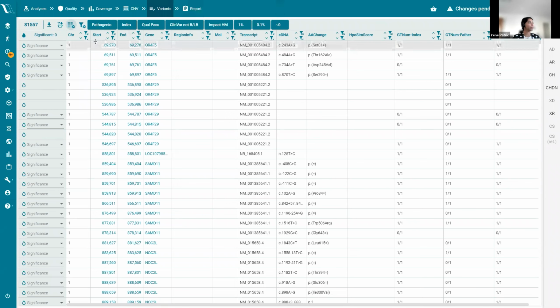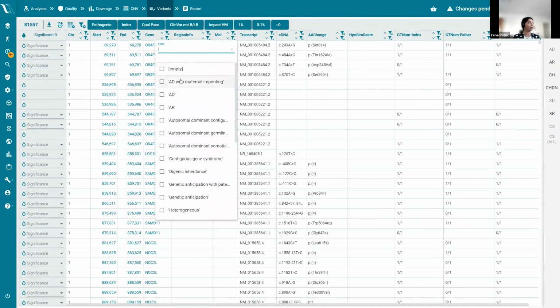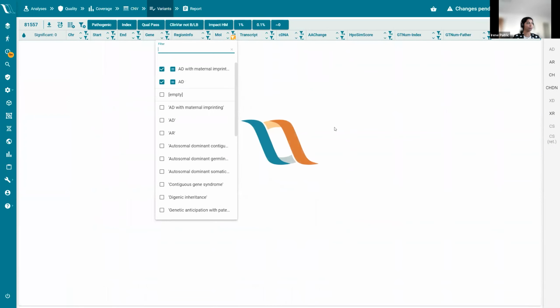The same is true of these filter buttons. These filter buttons can be created by the user by simply going to this create filter, applying certain filters that are required, and then choosing what we need.